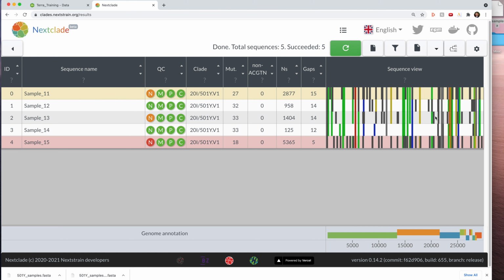And again, the concatenate column content workflow isn't in any way specific to Nextclade analysis. There are many different reasons that you might need to concatenate files from Terra. Nextclade analysis is just one. And I could make a whole other video series of all the different tools that take in concatenated files. But for now, I just want to make sure that you all are aware of how to use this workflow to combine assemblies into a single file.